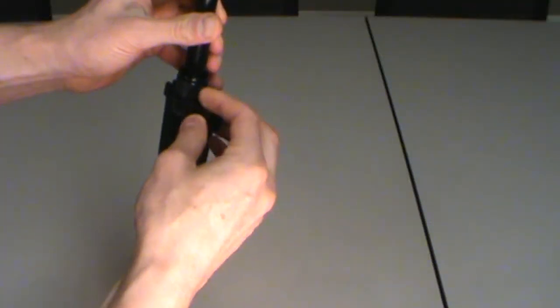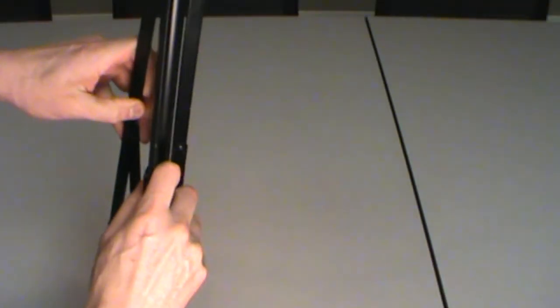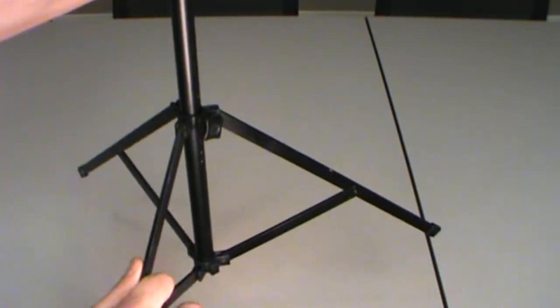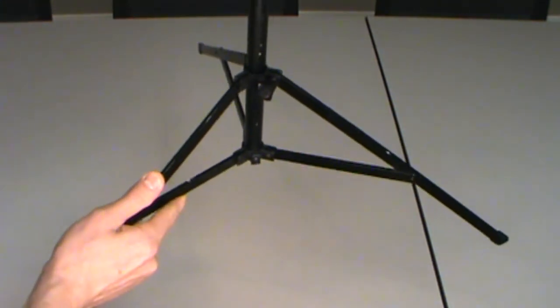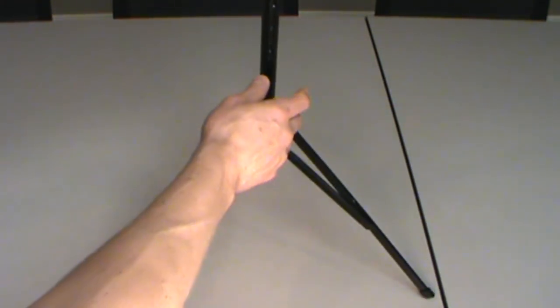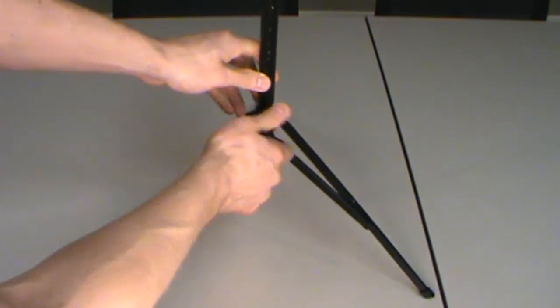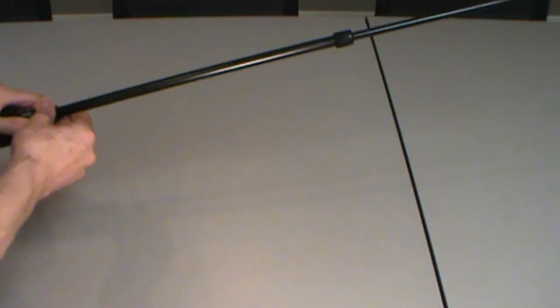First, set up your tripod. Extend the legs at the base and tighten the set screw so the legs don't slip. Now extend the tripod to its full height.